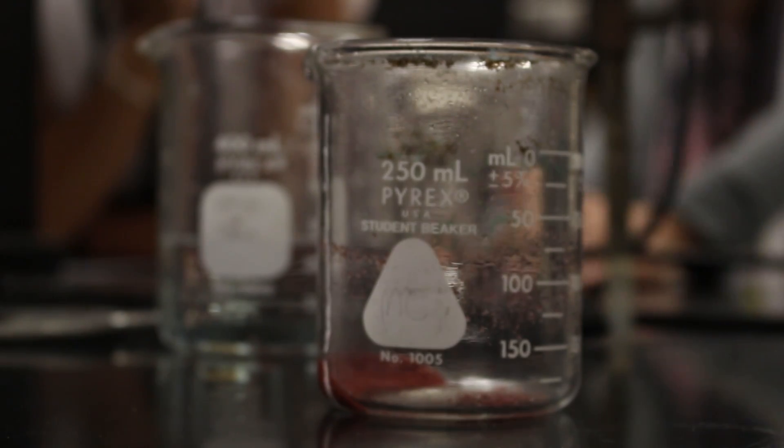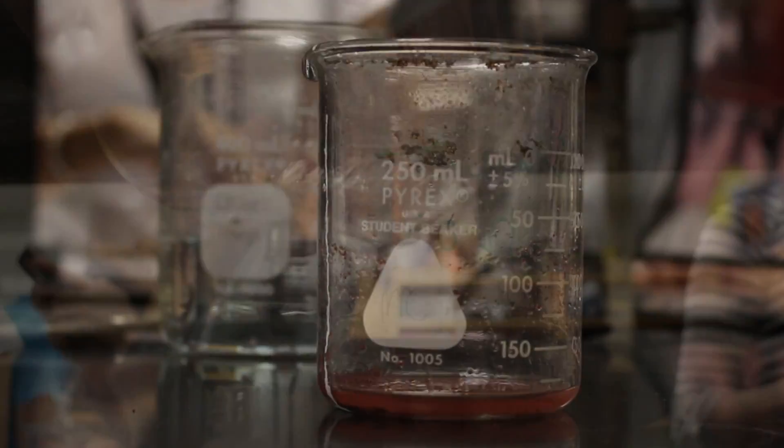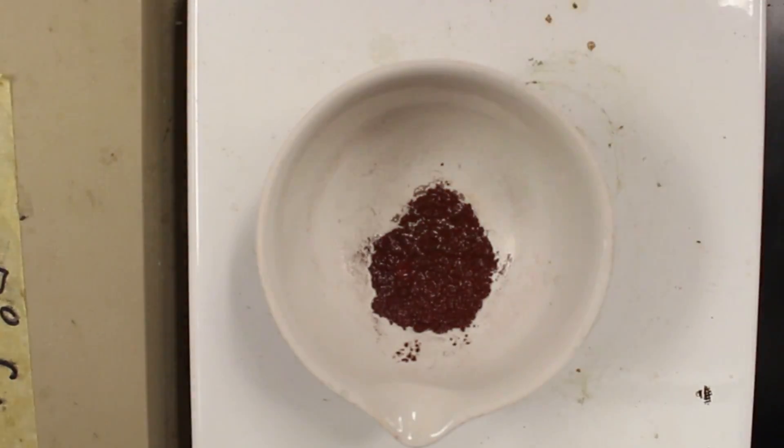We added 5 milliliters of acetone to help dry out the copper and finished drying it on a hot plate to produce 0.4882 grams of solid copper.